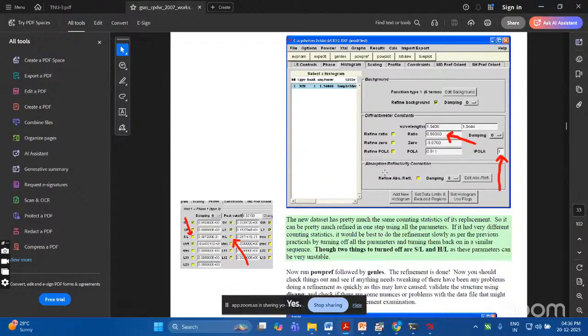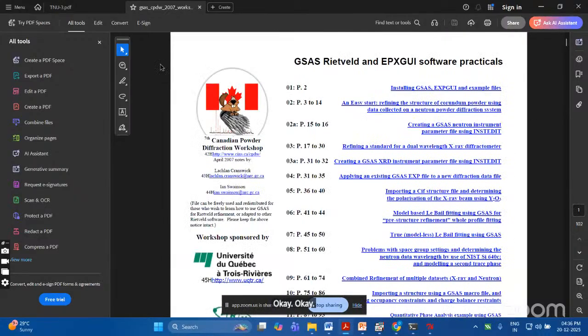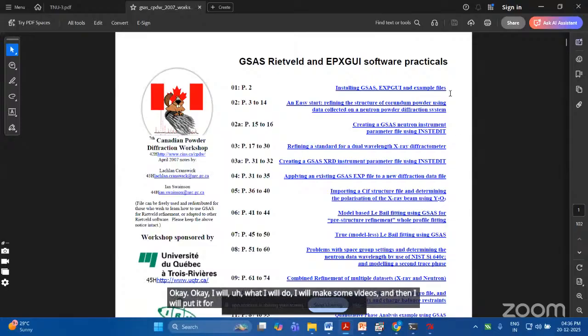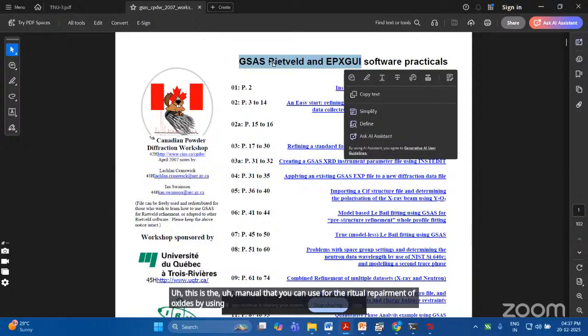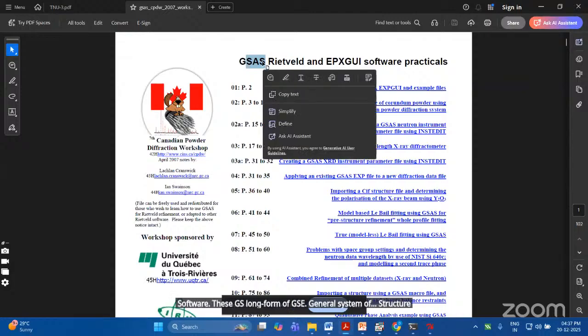Yes, sir. Okay. What I will do, I will make some videos and then I will put them for the students. This is the manual that you can use for the Rietveld refinement of oxides by using GSAS software. The long form of GSAS is General Structure Analysis System.